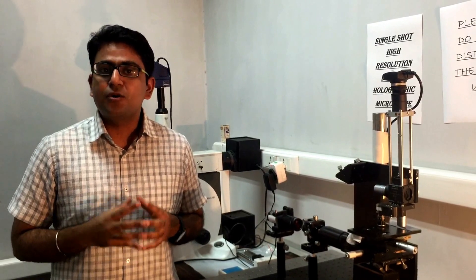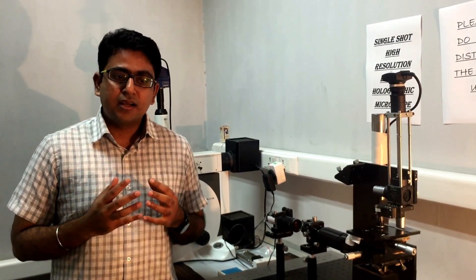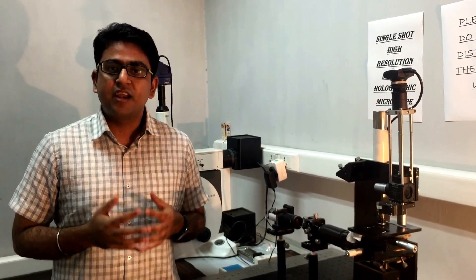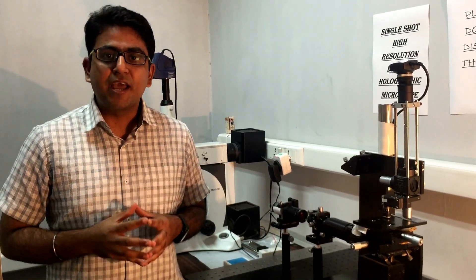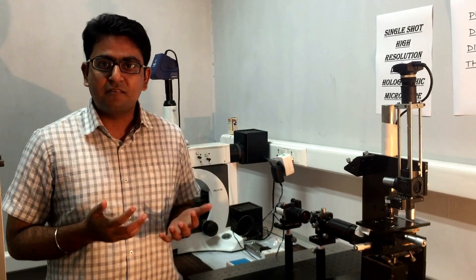Typically blood quality assessment is required before any operation or blood transfusion. Current methods used for this require a combination of multiple technologies, trained personnel, and are also time consuming, which is not a problem with our method.